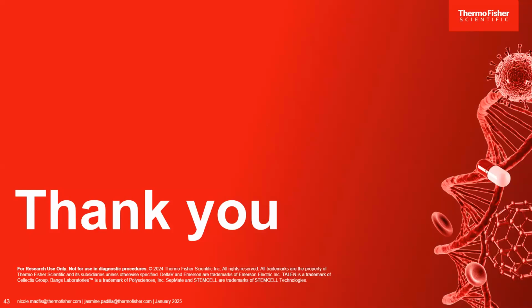All right, thank you. The next one we've got is, how can predictive morphology-based models alleviate bottlenecks in the manufacturing process? I can take that one. Predictive morphology-based models offer potential to streamline manufacturing by enabling early screening of donor material at day 0, identifying suboptimal inputs, and conserving resources. They can guide smarter allocation of reagents and manufacturing capacity by linking things like morphology parameters to expansion potential, thus facilitating reliable dose reductions.